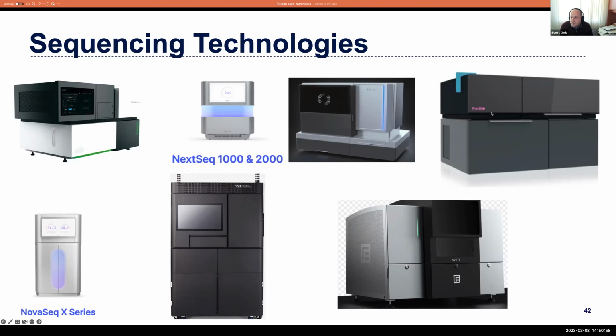This is a PacBio Onso system. This is sequencing by binding. So they're claiming that this will have quality scores up in Q40 or even Q50 when it's released. Its release is probably going to be mid this year. These other ones are sort of available.